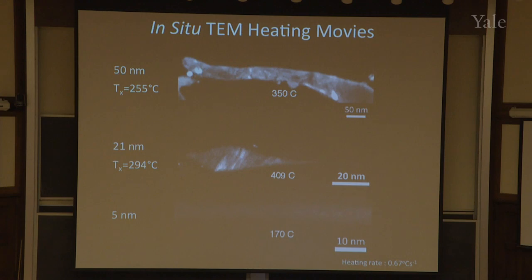That's weird. Now I have a 5 nanometer one, which is 10 times smaller than this one. And when I run this, here's 100, 200 degrees Celsius. Okay, 250, it doesn't crystallize. Okay, 290, it did not crystallize. Okay, there. This is the crystalline region.